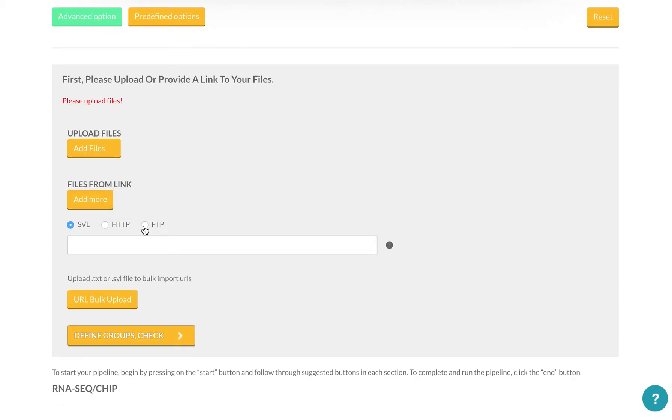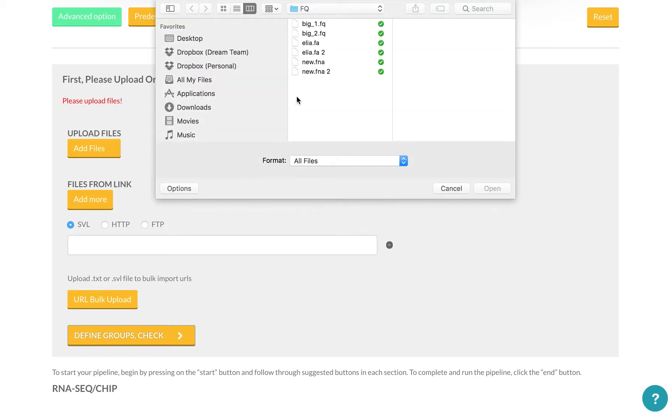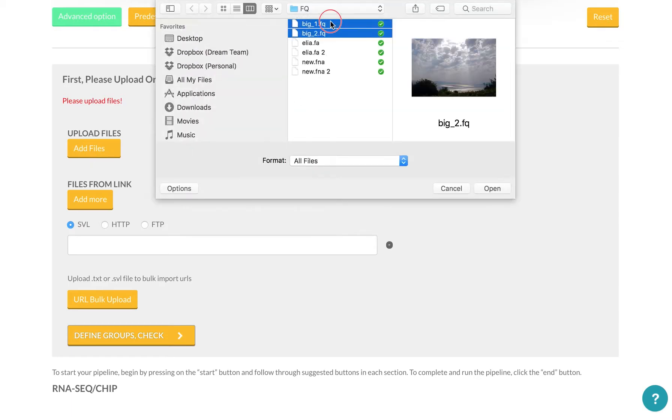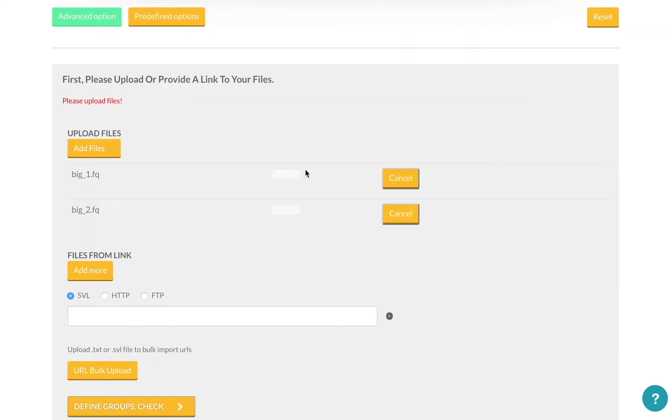Let me upload a few example files. So you can see that they will upload, and I can also cancel the upload.